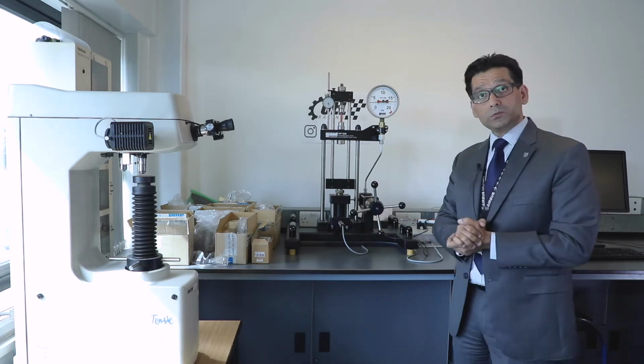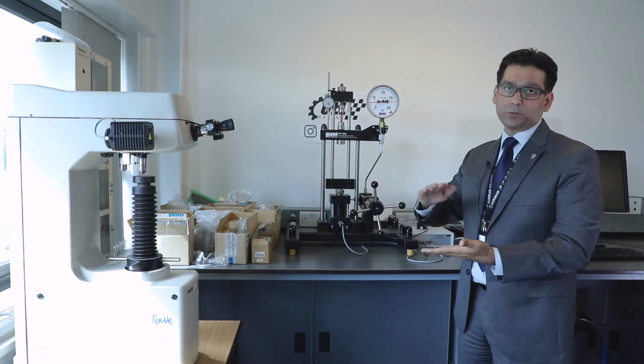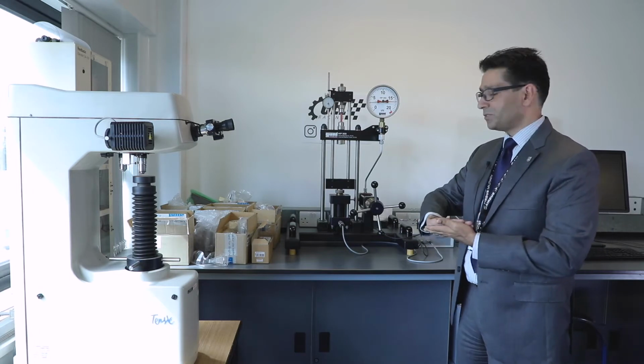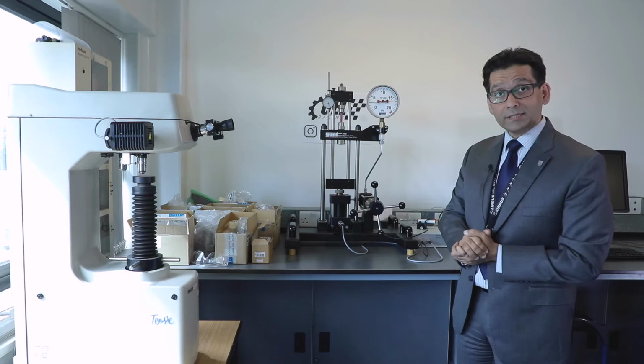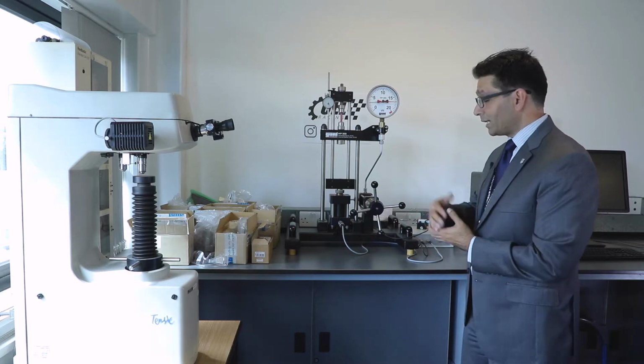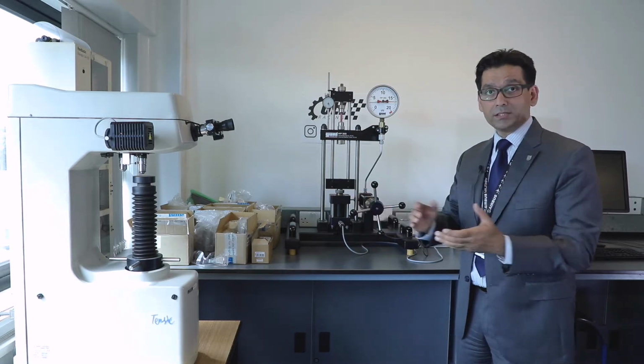They can also do the adhesion analysis. So let's suppose if they stick 2 layers of strips and they want to understand the strength of the bonding, that's what they can also analyze. As the name suggests, it's a universal material testing.